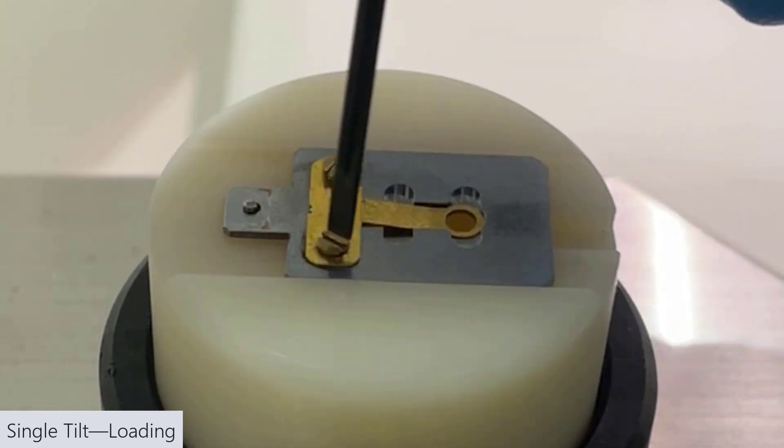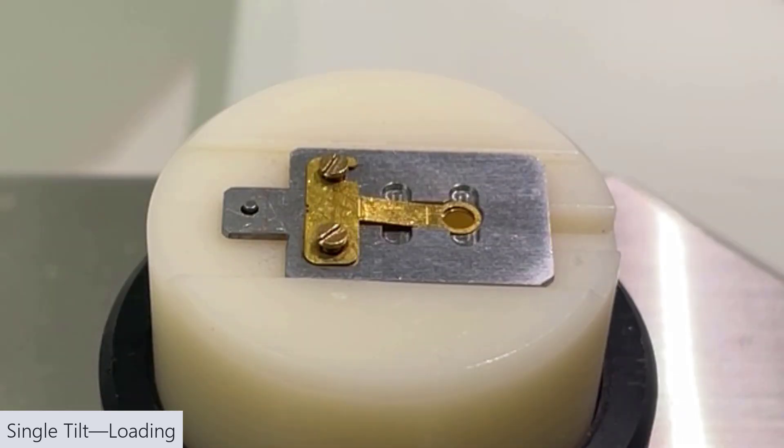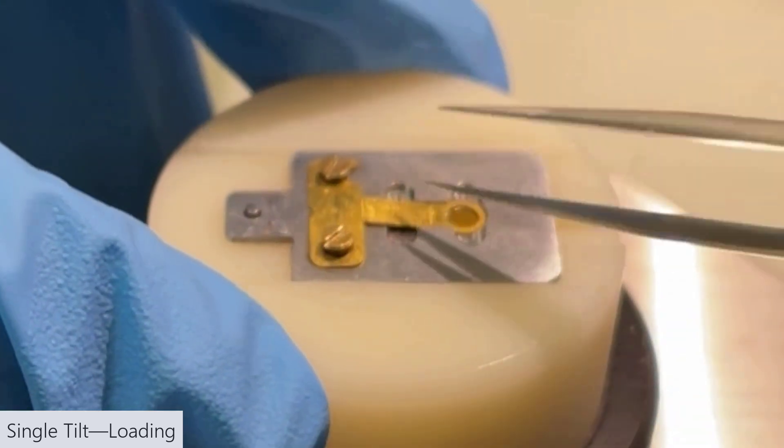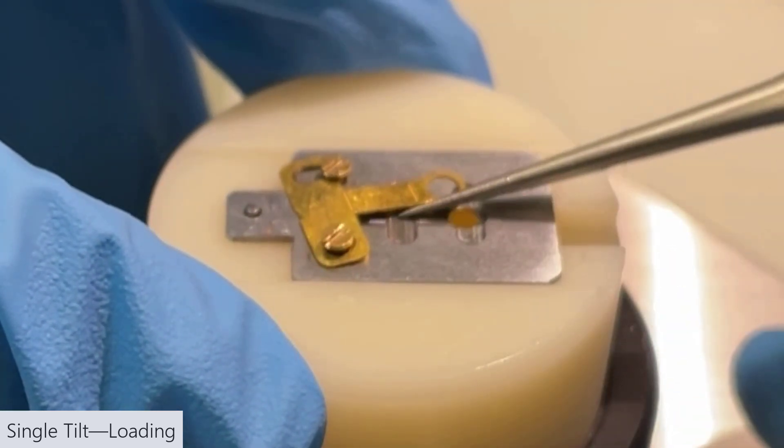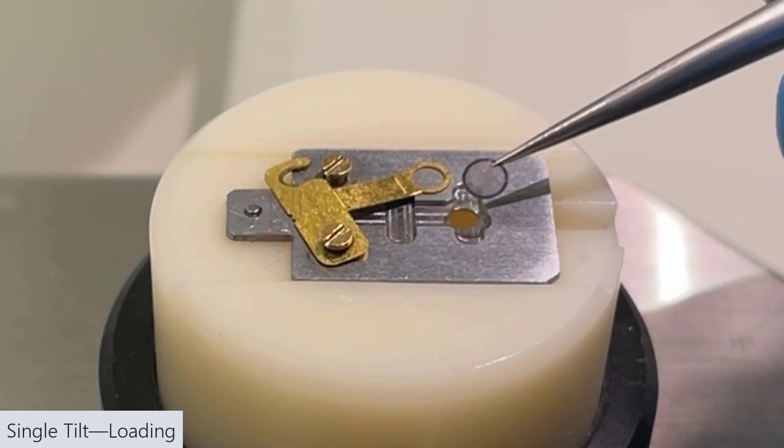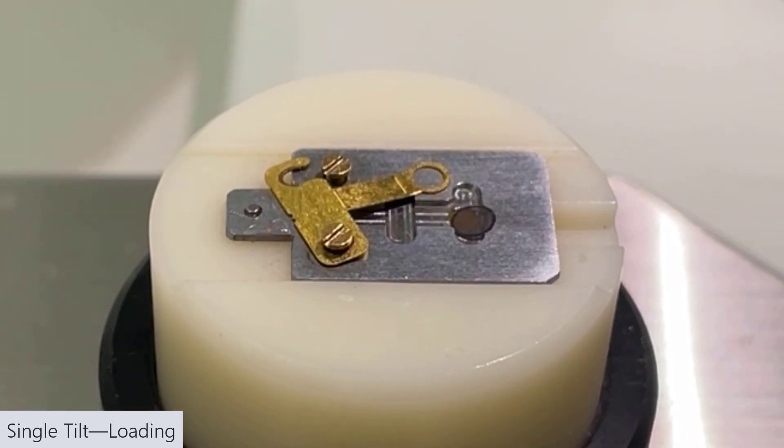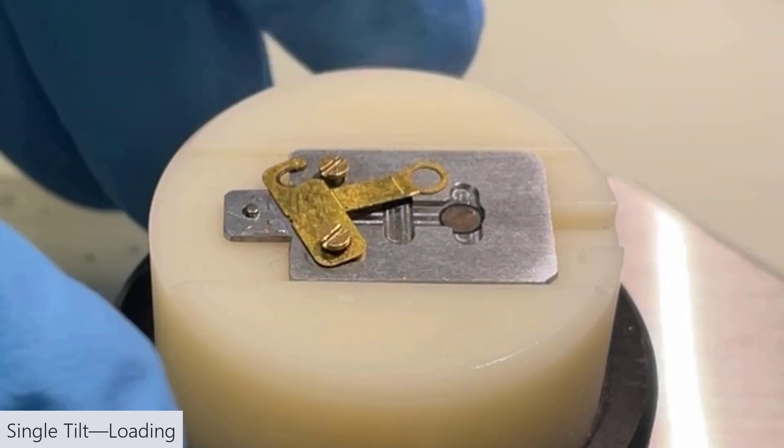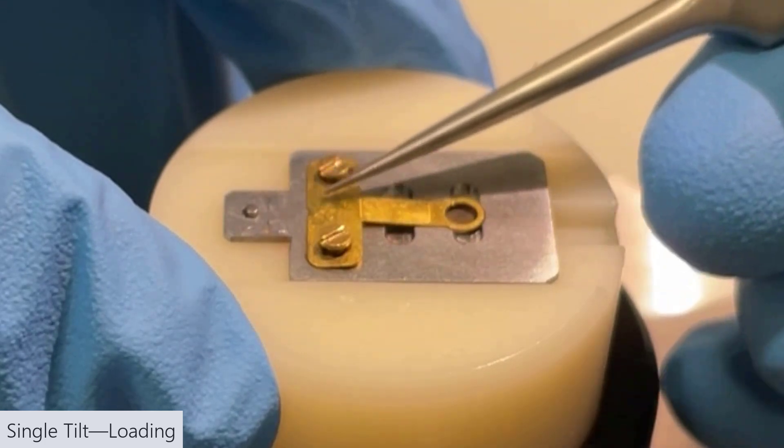Unscrew the screws. Then use tweezers to move the metal piece out of the way, just swing it to the side so that the hole isn't obstructed. Drop your grid in, whether a mesh grid or a FIB section grid, and then move the metal plate back in place.